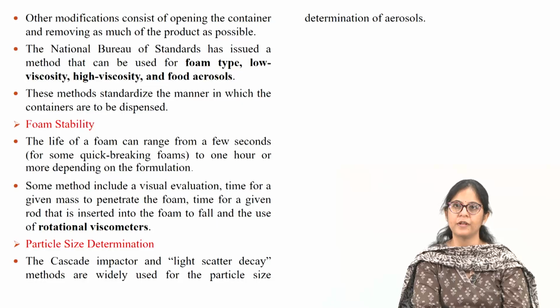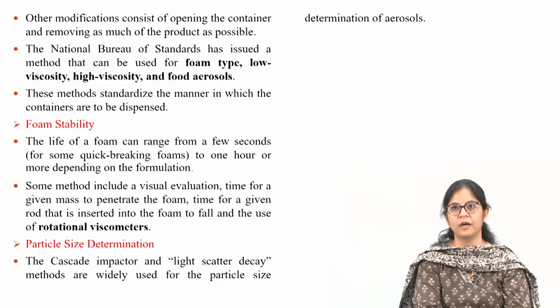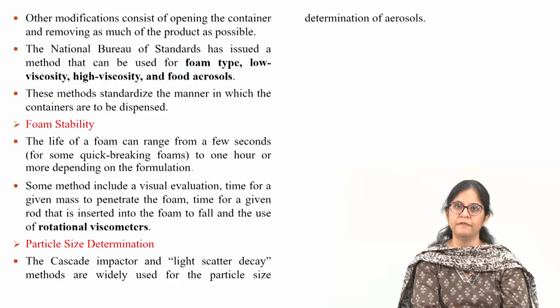The National Bureau of Standards has issued a method that can be used for foam type, low viscosity, high viscosity and food aerosols. These methods standardize the manner in which the containers are to be dispensed.